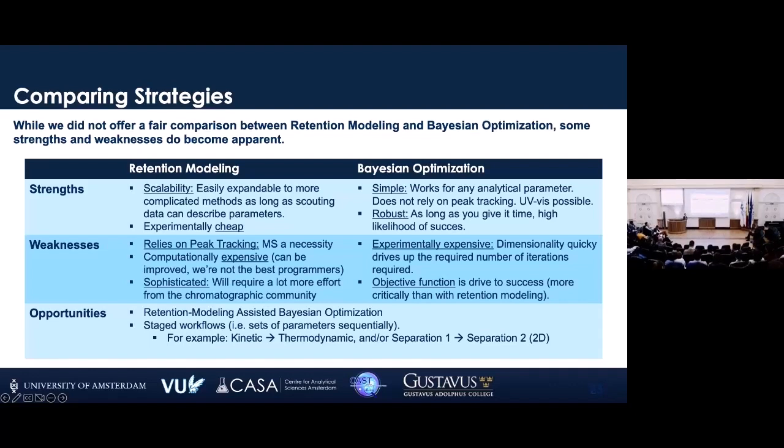Machine learning, it's amazing. It will always work. You can also use it for things other than LC. So like, I don't know, optimize a mass spec or a coffee machine or so, provided that you can tell it when something is good, right? So measure the concentration of caffeine in coffee. If that would be your thing, then this would be able to manipulate all of the parameters in such a way and then get you something that is really nice.